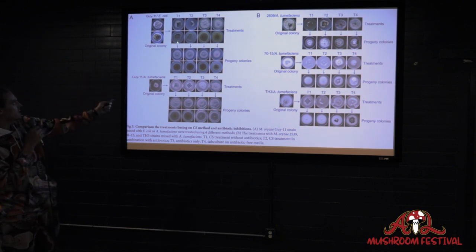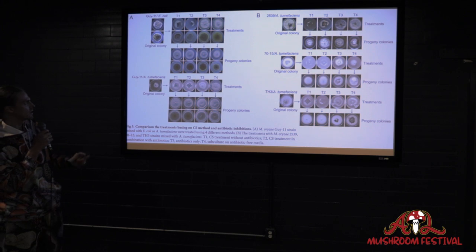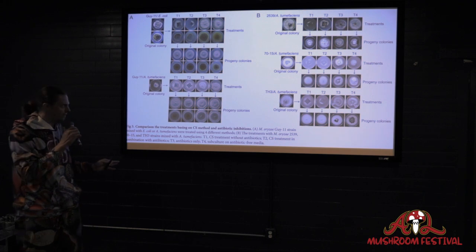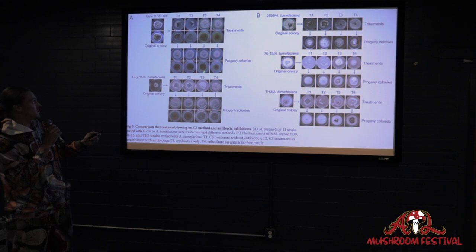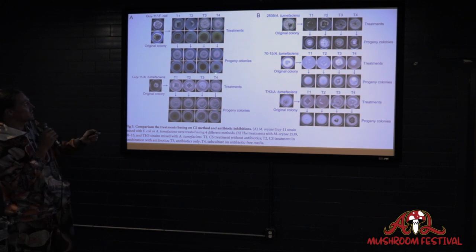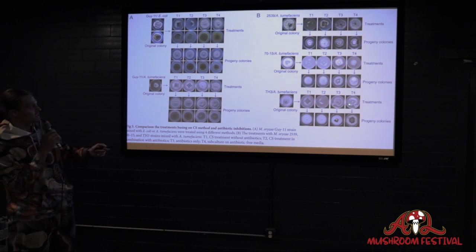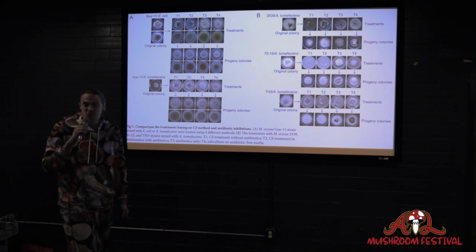And you can see between T1 and T2, in pretty much every case, there's not a giant difference. Maybe T1 looks slightly better on some, maybe T2 looks slightly better on some, but for the most part, they're pretty much the same. You can tell that the technique is very effective, especially when compared to antibiotics alone. You can see that there's a color difference. There's a difference in how quickly it grows. It doesn't look the same. And if you're just hoping and praying that you're running away from contamination, you can clearly see it's not working. And in some cases, you can even still see the contaminant still on the plate. There it is, your giant blob.